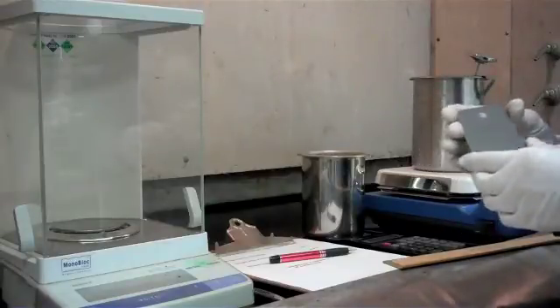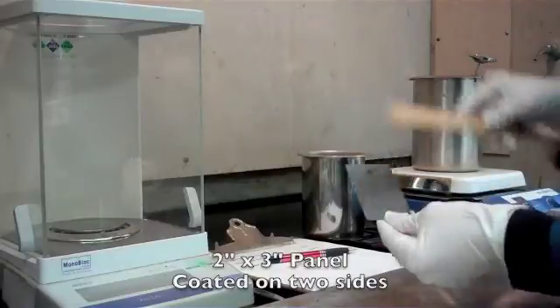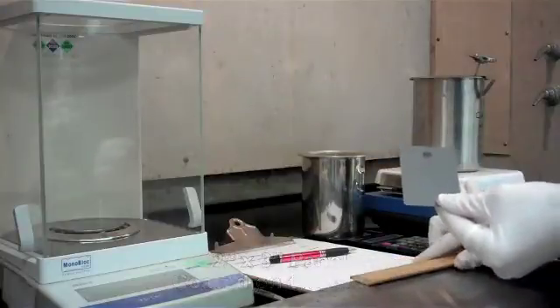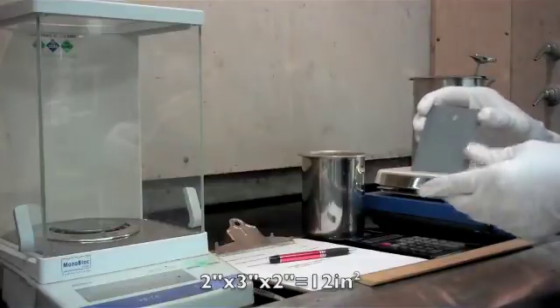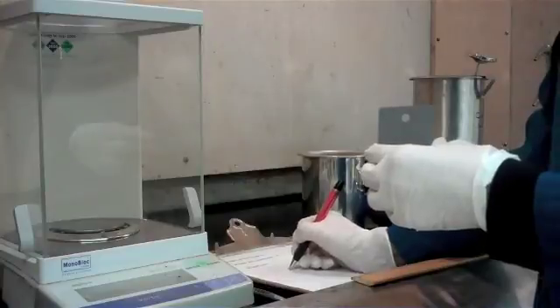In this case we're going to use a test panel, and this test panel is 2 inches by 3 inches, and it's coated on two sides. So our surface area is going to be 2 times 3 times 2, or 12 square inches. We're going to take that number and just jot it down for our calculations later on.